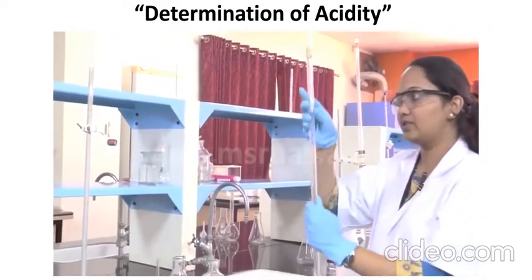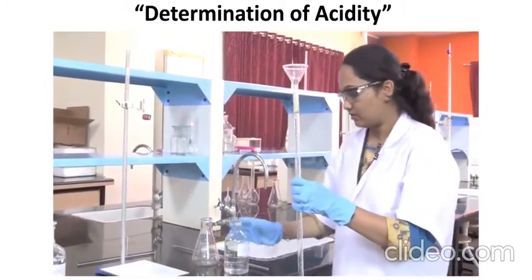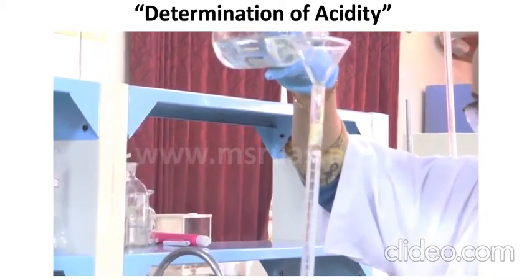Once the buret is rinsed with the sodium hydroxide solution, then we have to take sodium hydroxide in the buret for titration.